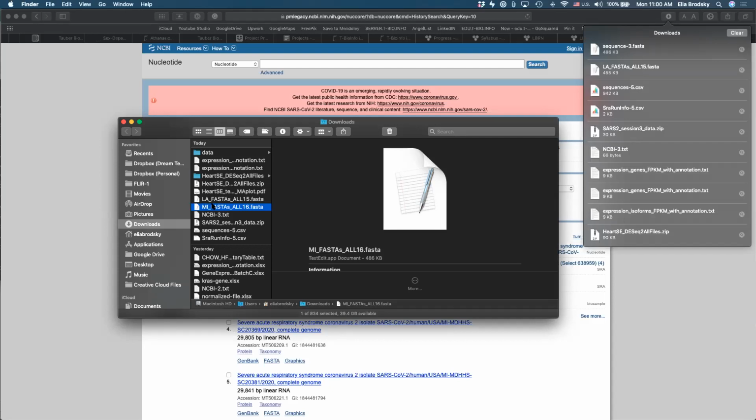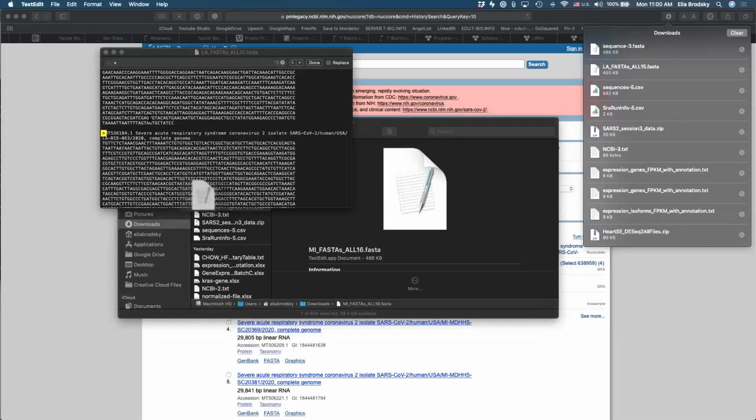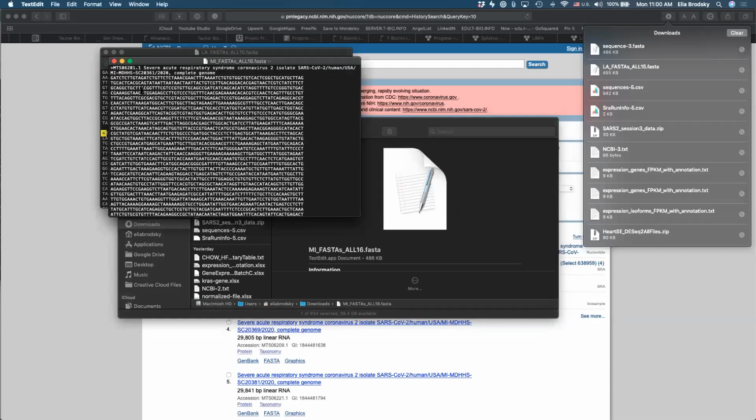So Benjamin is saying probably. What does everyone else think? Can we answer a question about the human factor using these FASTA files? Okay, Kasturi is saying no. Okay, and you can add an explanation why. Why do you think so? So what are these genomic sequences? If you have the metadata, not about the human factors, if the data is not available. Okay, so what is this data that we're looking at? These are genomic sequences.